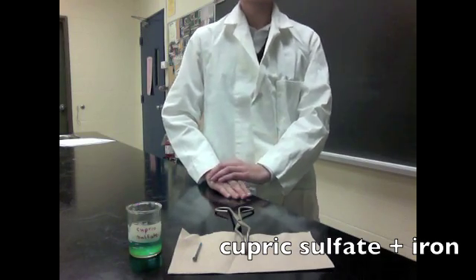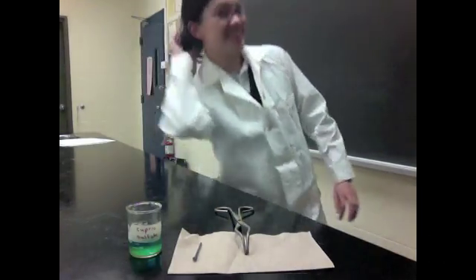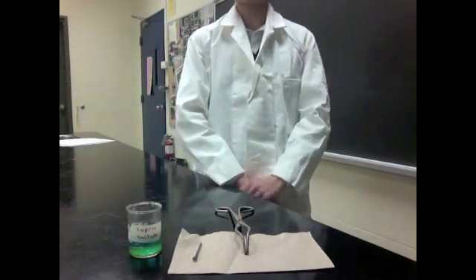So, for this lab, you will need your safety goggles. Girls, you will also need to tie off your hair so that you don't damage your hair.